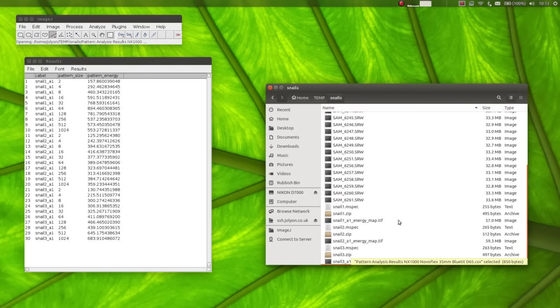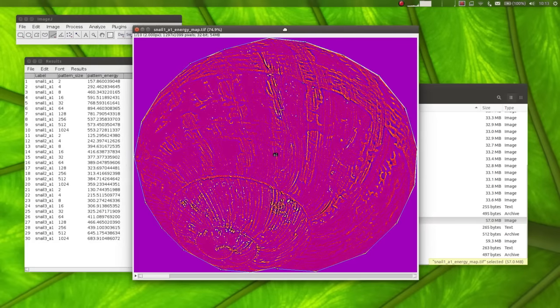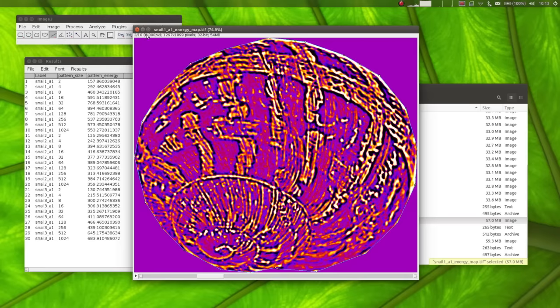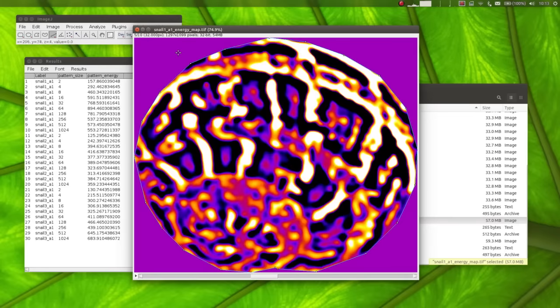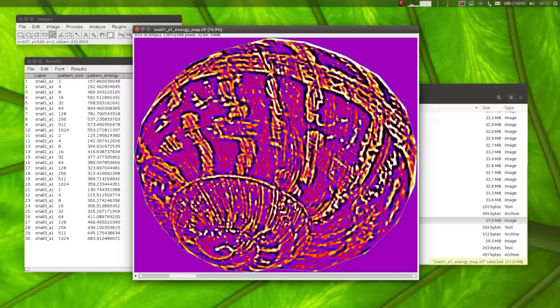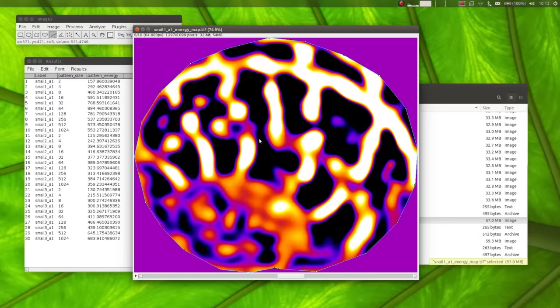I also output the energy maps so that you could see them being created. Then you can load them back into ImageJ to have a look at what was going on. So here's Snail1's energy map, and you can scroll through and it tells you at the top here that this was the 8 pixel scale, the 16 pixel scale, 32, etc. So you can see that there's not much energy going on here, and then there's more and more energy as we get to larger scales.